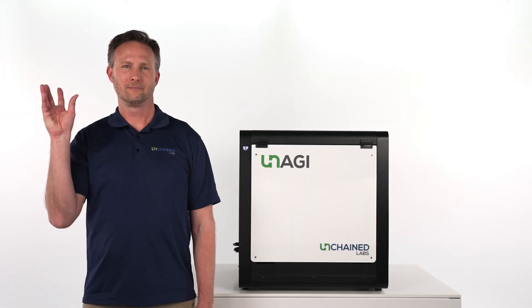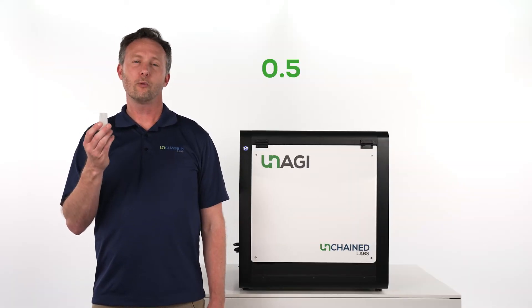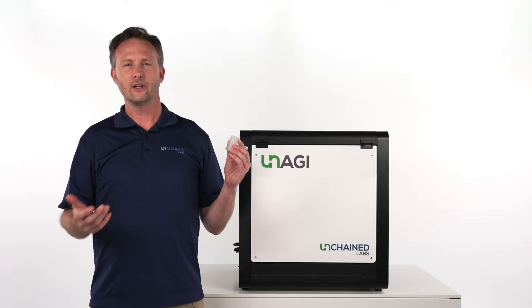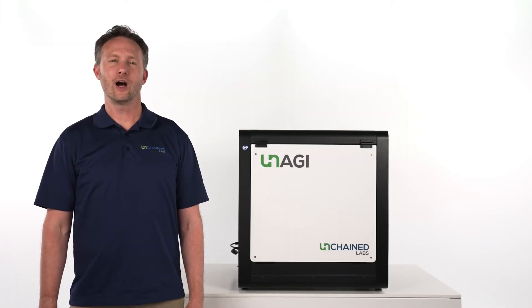Unagi processes your samples using the UNA. Each UNA holds from 0.5 to 8 mLs of sample and uses a regenerated cellulose membrane, so your sample stays put, doesn't get absorbed, and buffer can pass right through.